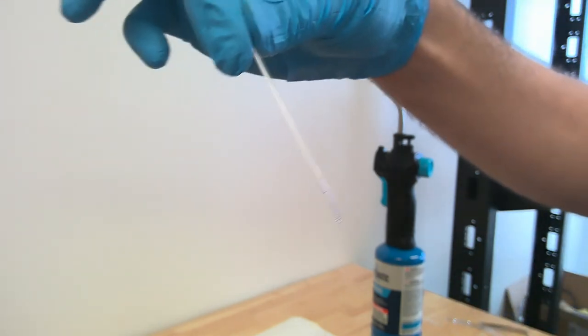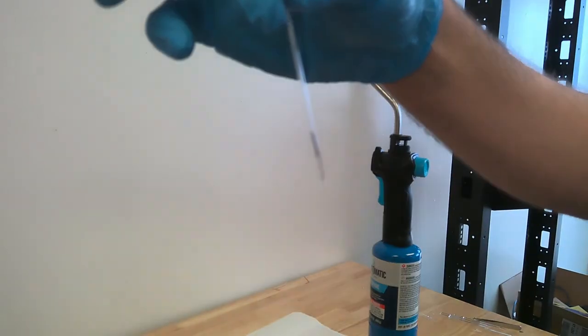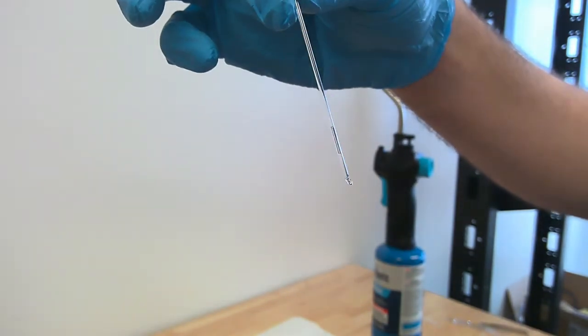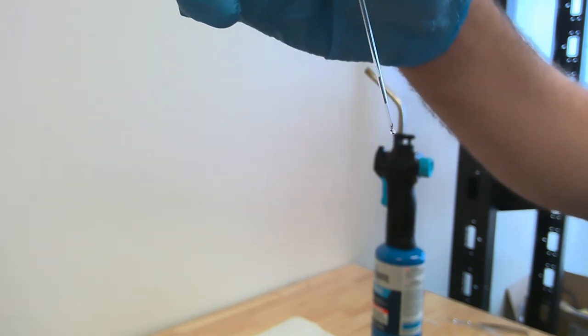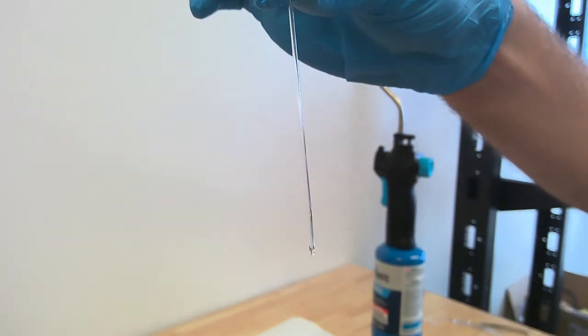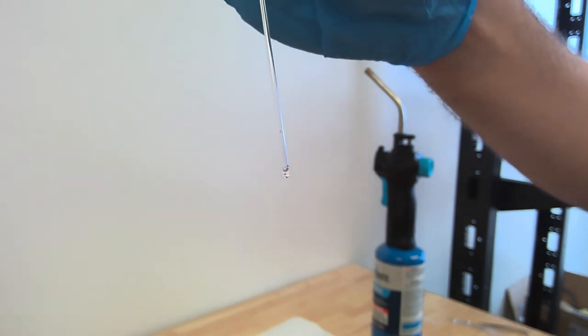Additionally, we prepared a sample example of an evacuated melting point capillary tube. So we showed example procedures for how to load your capillary tube with solid material and how to seal your capillary tube under vacuum. This is a technique that will be utilized in our caffeine analysis laboratory. Additionally, we've also prepared a boiling point capillary tube containing a small capillary bell. This is used for boiling point determination.